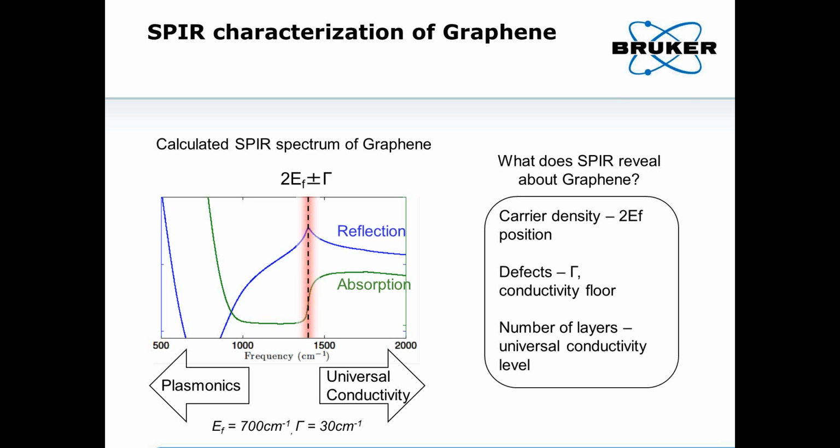method, the graphene spectrum is even more interesting, primarily because when one uses near fields that are confined to regions much smaller than the plasmon wavelengths in graphene, one can actually excite plasmons, which exist in this lower frequency side of this infrared spectrum.